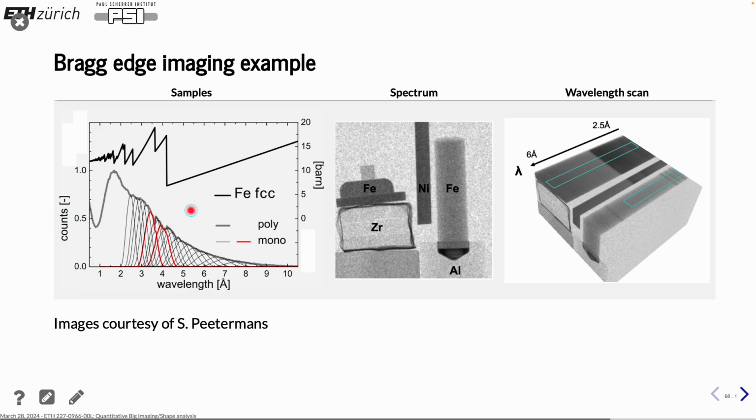And then we have our spectrum, and if we run a spectrum scan over this assembly where we have two different types of iron and some other metals, then we can see in one case it appears like we have this strong edge, and in other cases you only have small reflection peaks, and the difference between them is that the one is powder-like and the other one is a single crystal. So our main interest is in the powder-like style, because then we get this pattern.